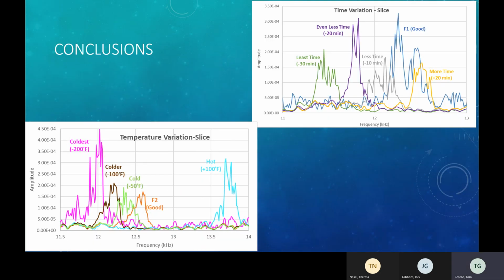Through our testing, we found that there is a relationship between the resonance spectra of Mott's porous powder metal parts and the sintering condition. If a part was sintered for either too little time or too low of a temperature, the spectra shifted downward. The same trend is apparent in over-sintering, where the fingerprint shifted upward compared to the control samples. With this data, we are able to establish a criteria that the peaks must fall under so that it can be used to easily quantify if a part is good or bad. If it passes this criteria, it will then be able to tell in mere seconds if a part performs to spec.